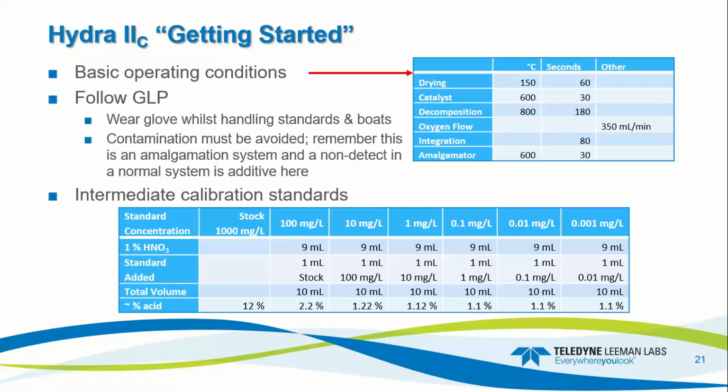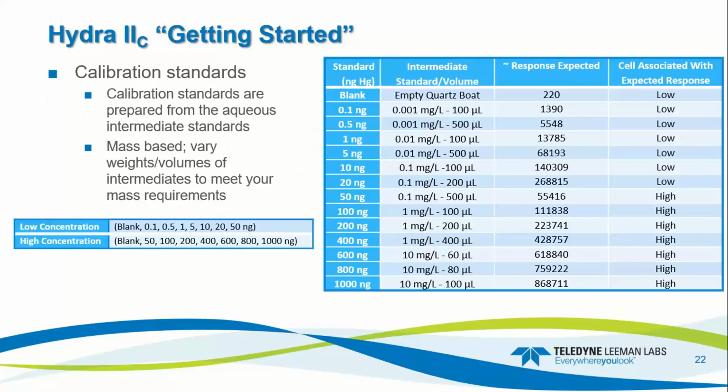We don't put hydrochloric acid in these standards, only nitric, and they're not very well preserved at low concentrations of acid. So at best, these standards are only good for a few days, the lower level ones, and you have to remake them. So how does this thing work?